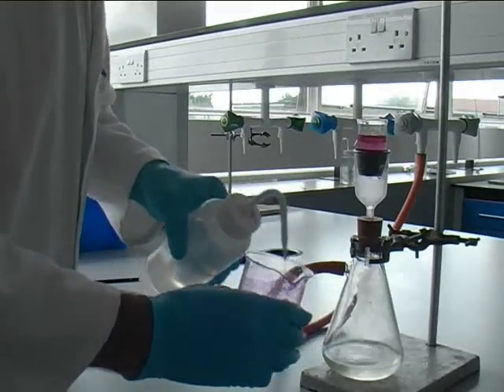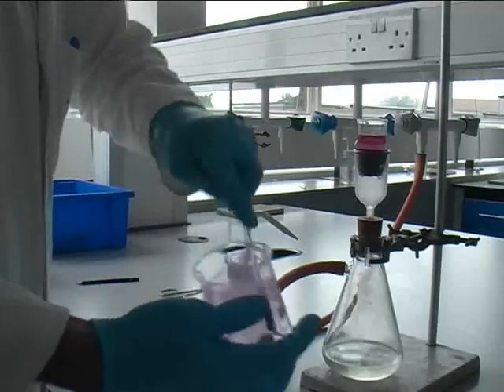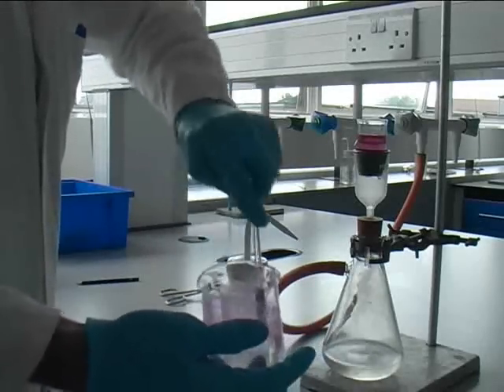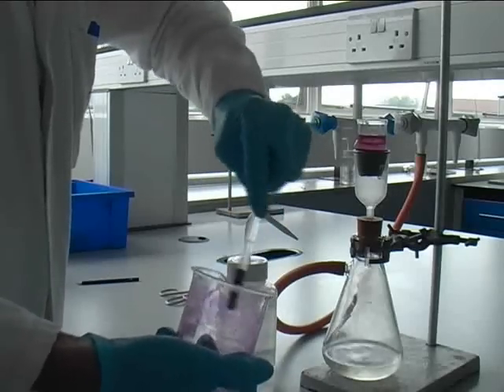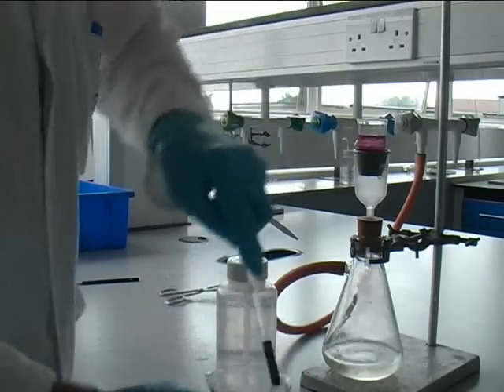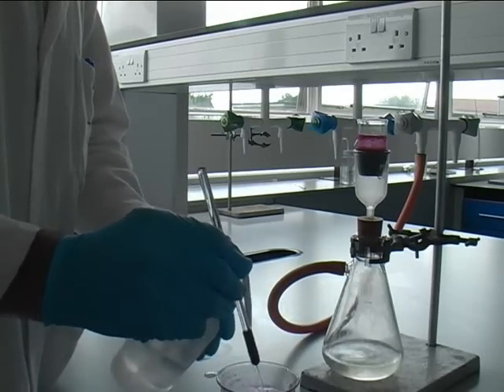The beaker is cleaned by adding a few mils of deionised water and rubbing the sides vigorously with a rubber policeman. All the coloured nickel complex must be transferred from the beaker to the sinter. This is known as a quantitative transfer.